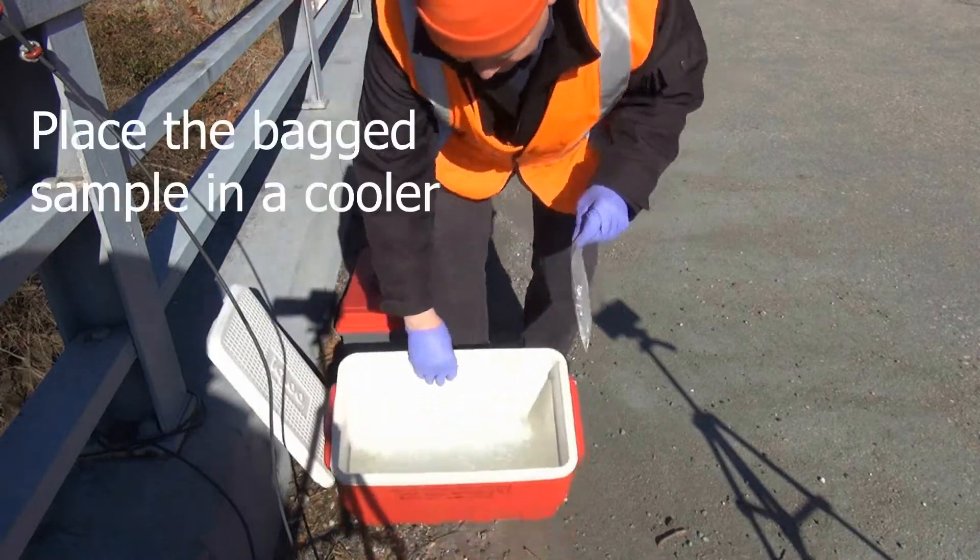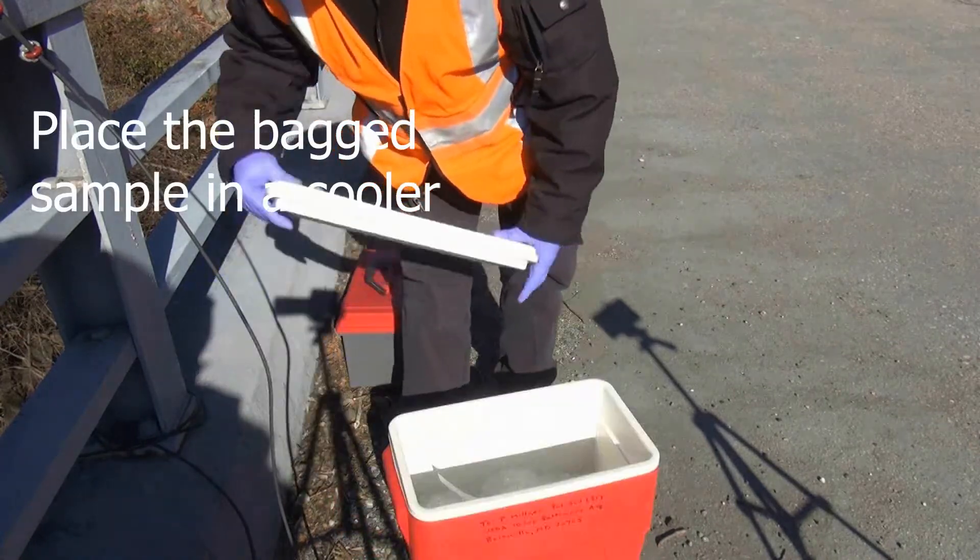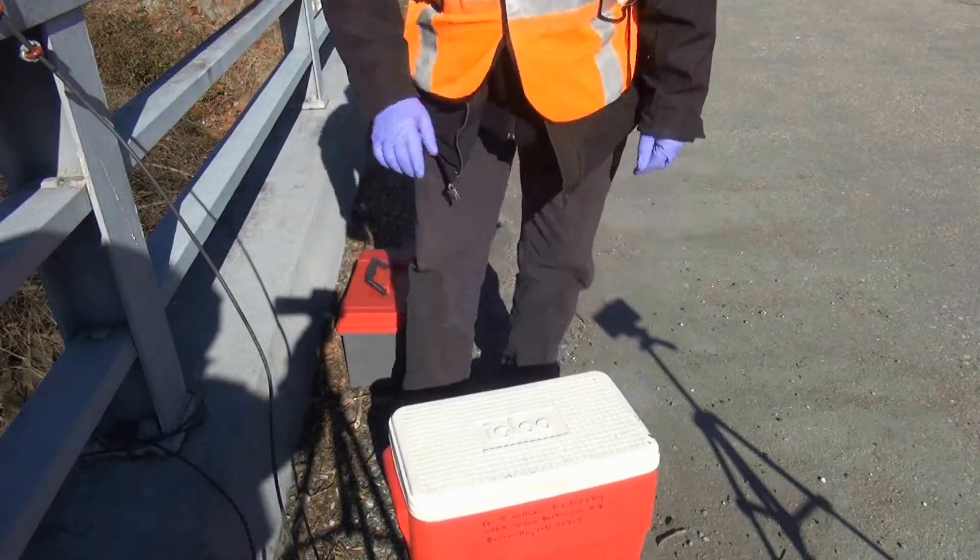Place the bag in a cooler with bagged ice or ice packs for transport back to the lab. Pack carefully to make sure no ice or other samples might puncture the membrane.